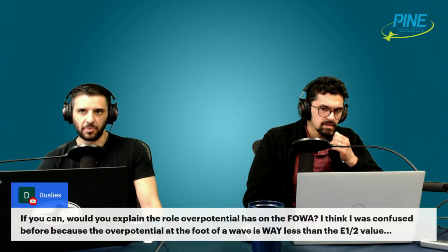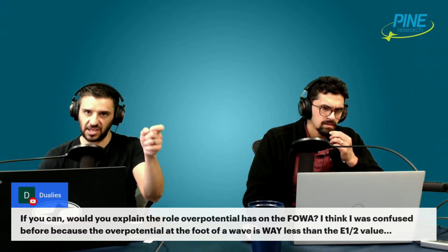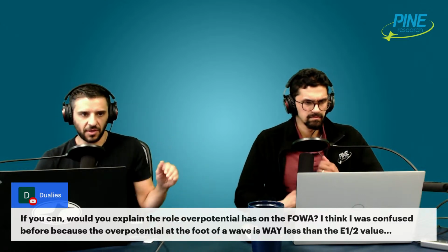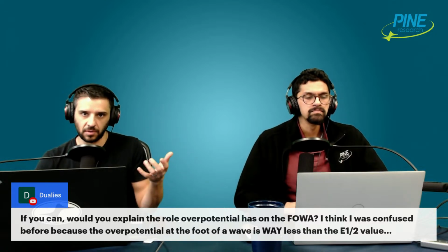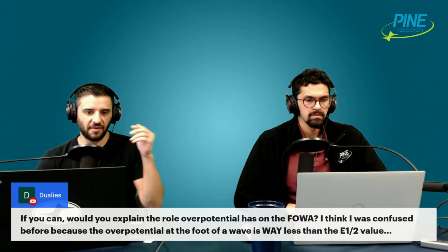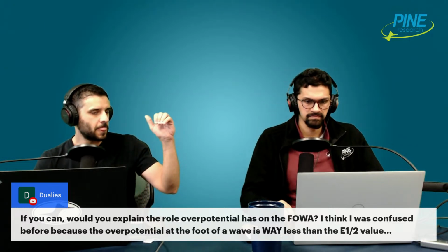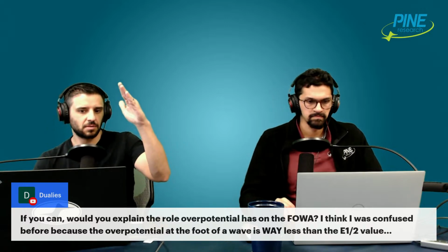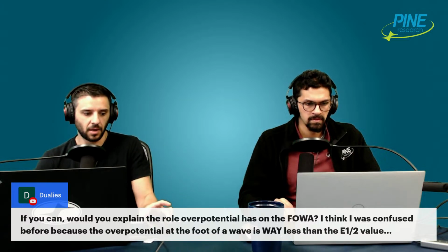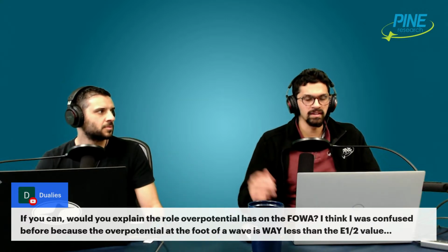So it's a common misconception that, for example, no oxidation occurs until you are greater than the E0 or at E1/2, right? It happens before then. And so the foot of the wave or the onset potential, whatever terminology here, indeed, is before the E0 or the E1/2 occurs. You've talked about this before. Like Butler-Volmer kinetics, the current increases. We tend to say, and I'm guilty of this all the time, that oxidation does not happen until you get greater than E0. It's not technically true. Yeah, right?